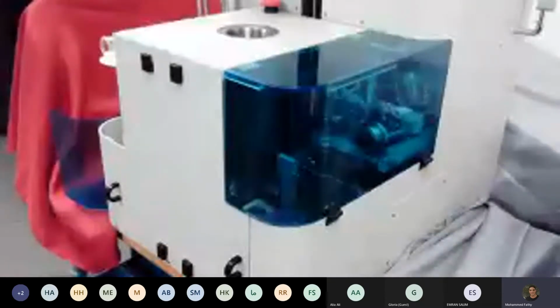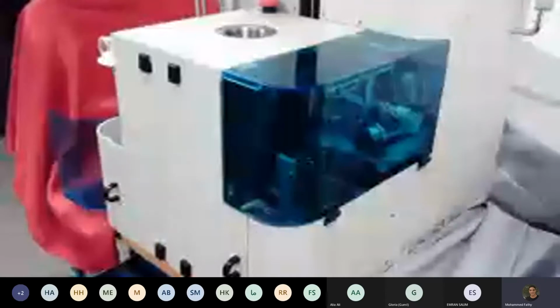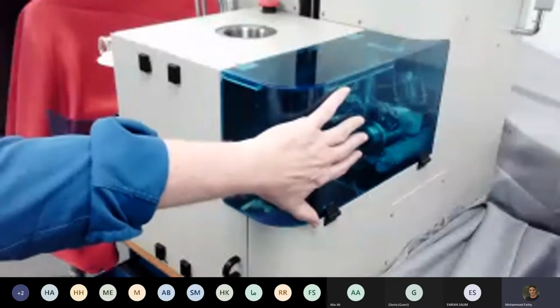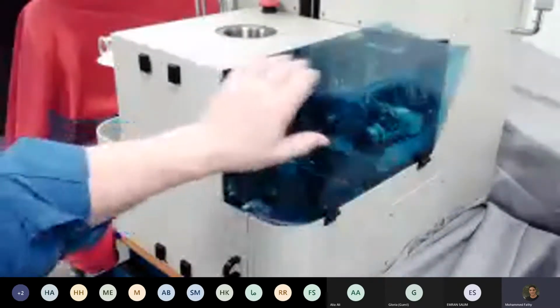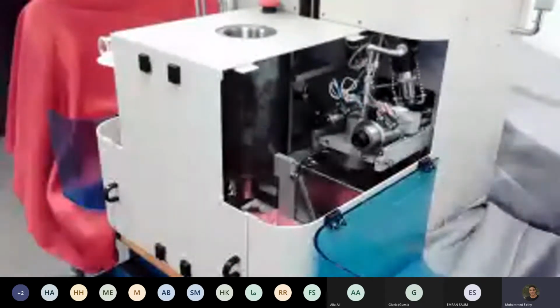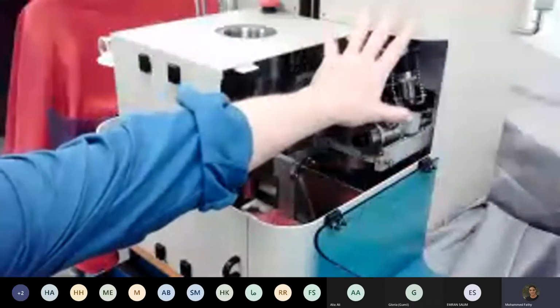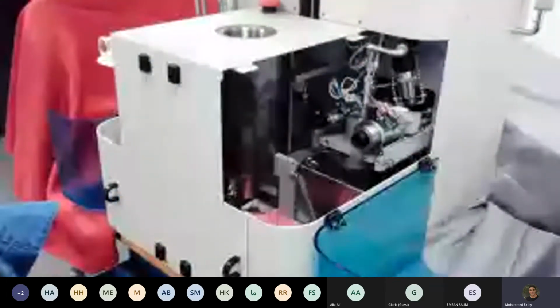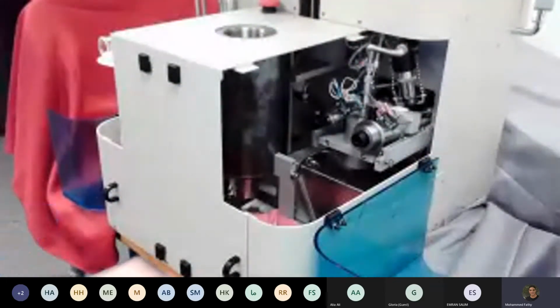So I'm just going to show you some of the features. This is the Poremaster, and this is a low pressure station here behind the door. Also on this instrument, I've had my colleagues remove some of the internal paneling here, so we can see a little bit more of the features.